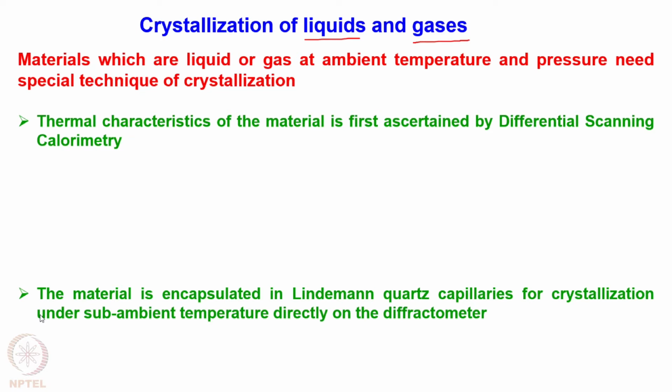In case of differential scanning calorimetry, we take a substance at a given temperature, we plot temperature on the x-axis and heat flow on the y-axis with endo up, which means all the endothermic transitions will have a peak, and exothermic transitions will have a dip.